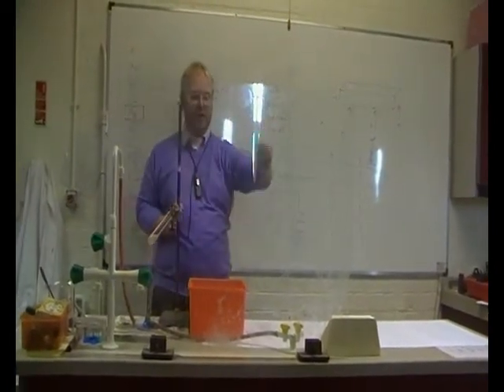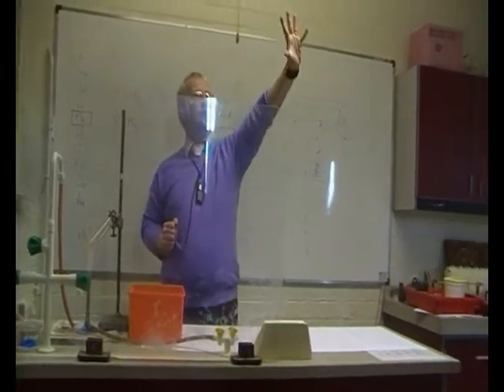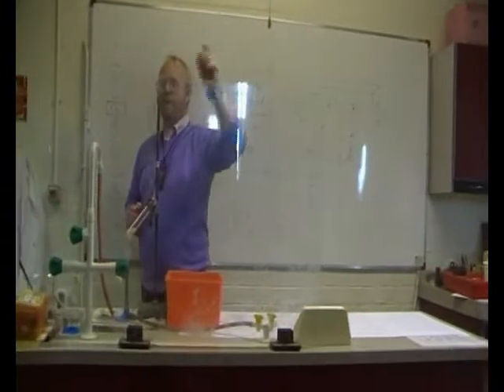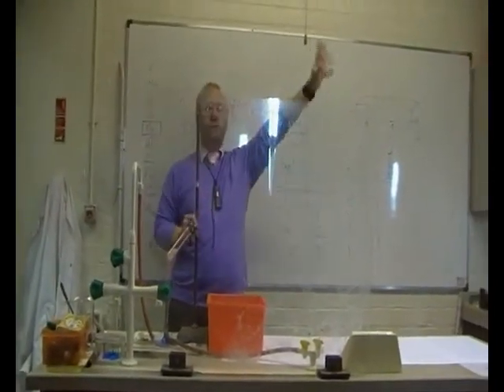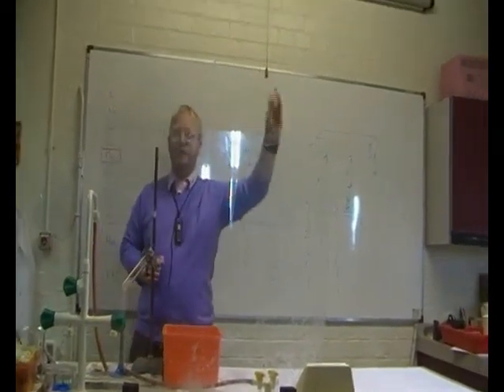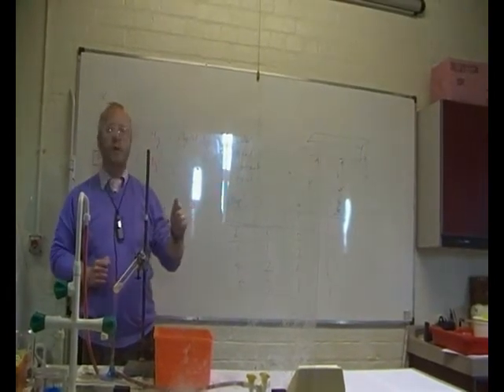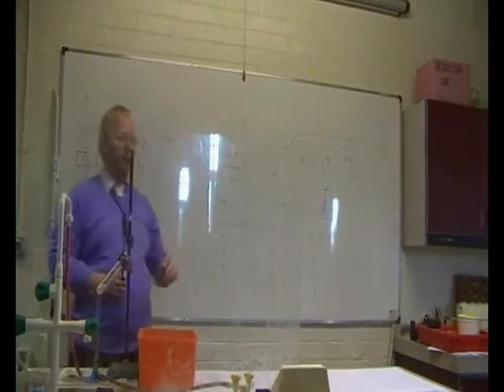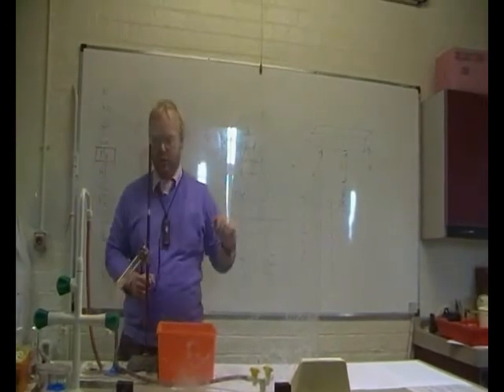And so what we're hoping to see, we're going to put this boiling tube in here, we should see some hot wax project forth into the air. Now that would be quite cool, but the wax should be hot enough that when it bursts forth into the air and mixes with the air, it is hot enough to instantly ignite itself. So I won't need to use a match, or a Bunsen burner to make it light. So it will go into the air and it will set fire and possibly burn the lights.